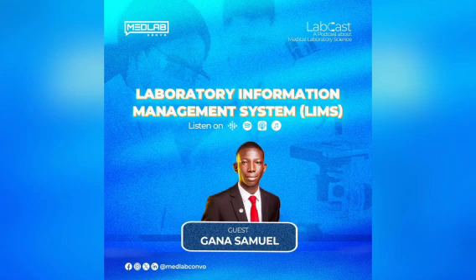Now, the most expensive is the on-premise LIMS, and in this one, the software is installed into the facility, and the servers are located within the facility. So the scientists and their computer engineers are the ones that are managing everything that is associated with the lab, and that is pretty expensive. But however, there is maximum control of everything that happens to your data.